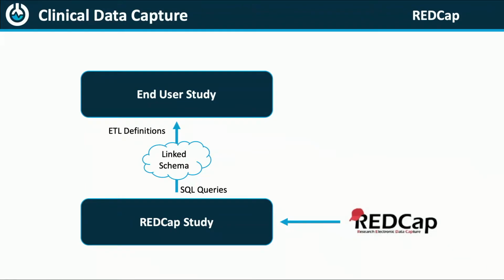Now, you can imagine this is one study, but you could do this multiple times for multiple studies. One example of this is our departmental-wide implementation. We have clinical studies that are ongoing, doing data entry, and they're interested in specific questions. Now, the chair of the department says, well, I actually want to aggregate all that data, de-identified, and I want to mine it. So I want to do cohort discovery. And not only that, I want to take all samples that have been consented and put them in a central bank that anybody in the department can request to do research. This layer in between actually allows us to do that, because we can take specific queries for specific purposes and link those across containers and do a centralized repository.